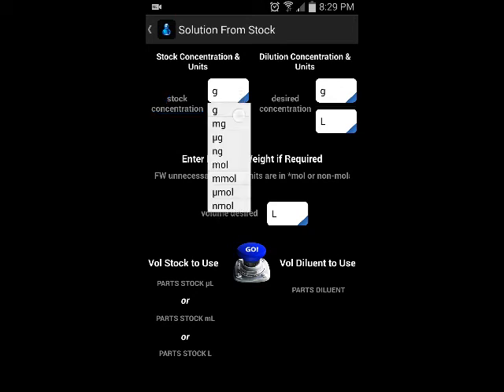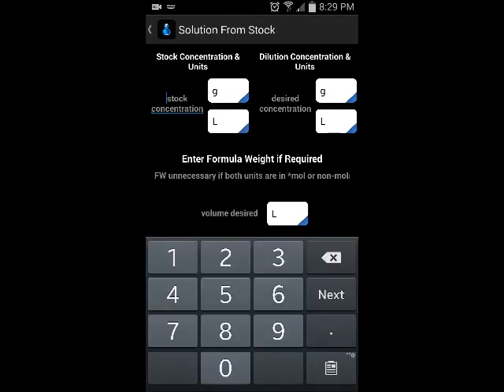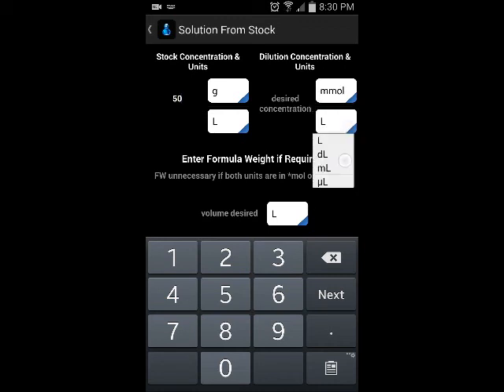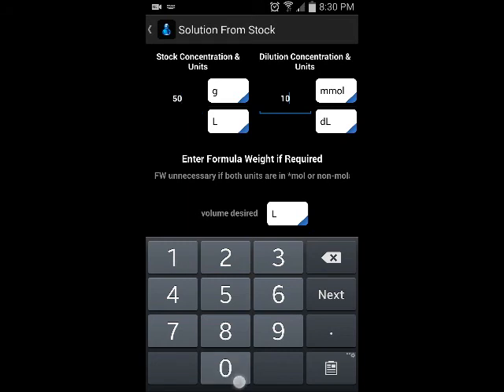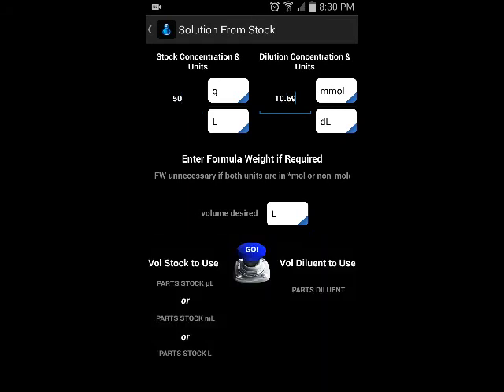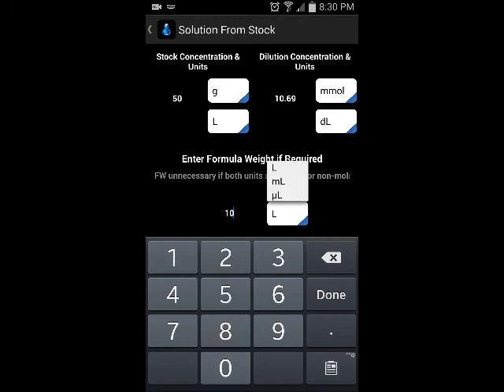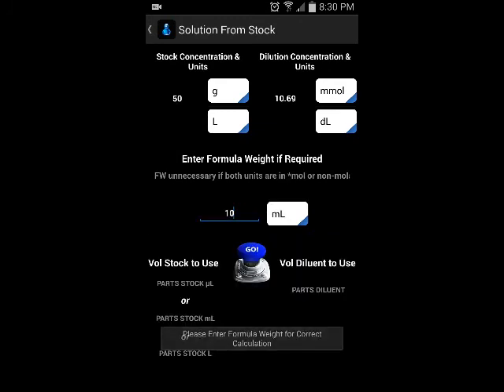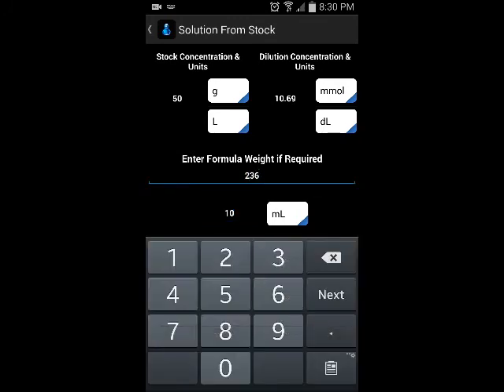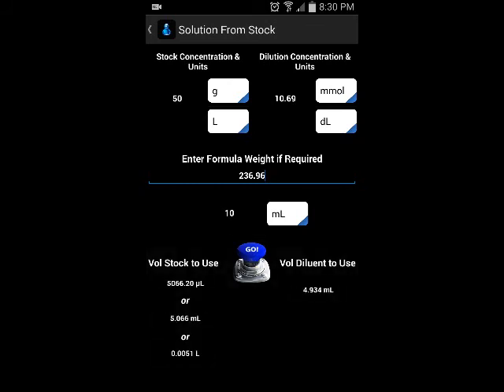So if you have a solution with a unit like grams per liter — maybe you got this from another university or a friend from industry gave you the solution — and you don't really want grams per liter, you can pick, for instance, millimoles per deciliter. Pick whatever value you want as the dilution concentration and then enter the desired volume. Notice we forgot the formula weight, so it prompts us for that. After entering it and hitting go, we easily get the volume of diluent to use — 4.934 milliliters.